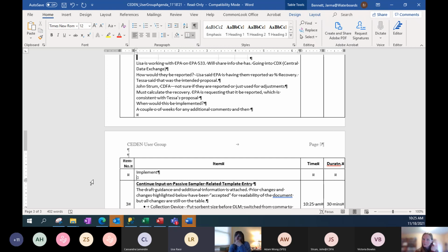Yeah, that's a good point. So some of these compounds could be in the database more than once, one as a surrogate, one as an isodilution analog. And I was going to mention too, I think there are some methods where you could choose to do isotope dilution or not. So the method name itself doesn't necessarily tell you what the lab did, just to make it a little more complex.